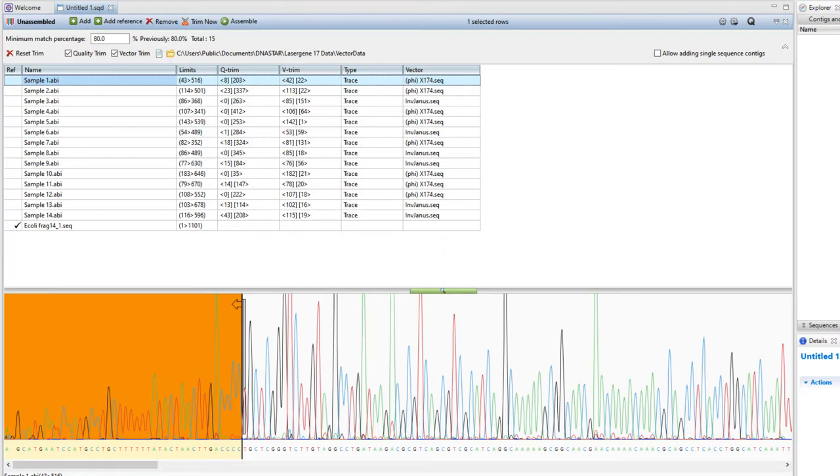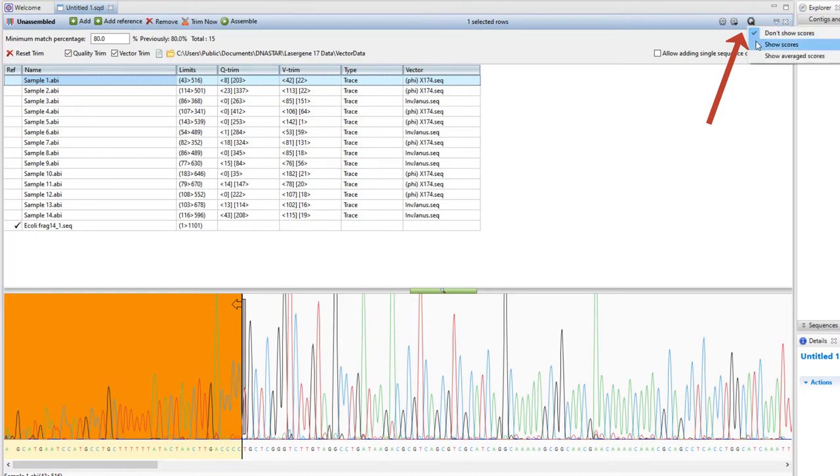To display quality scores, you can click on the Q tool in the upper right corner. You can choose to show scores or show average scores.